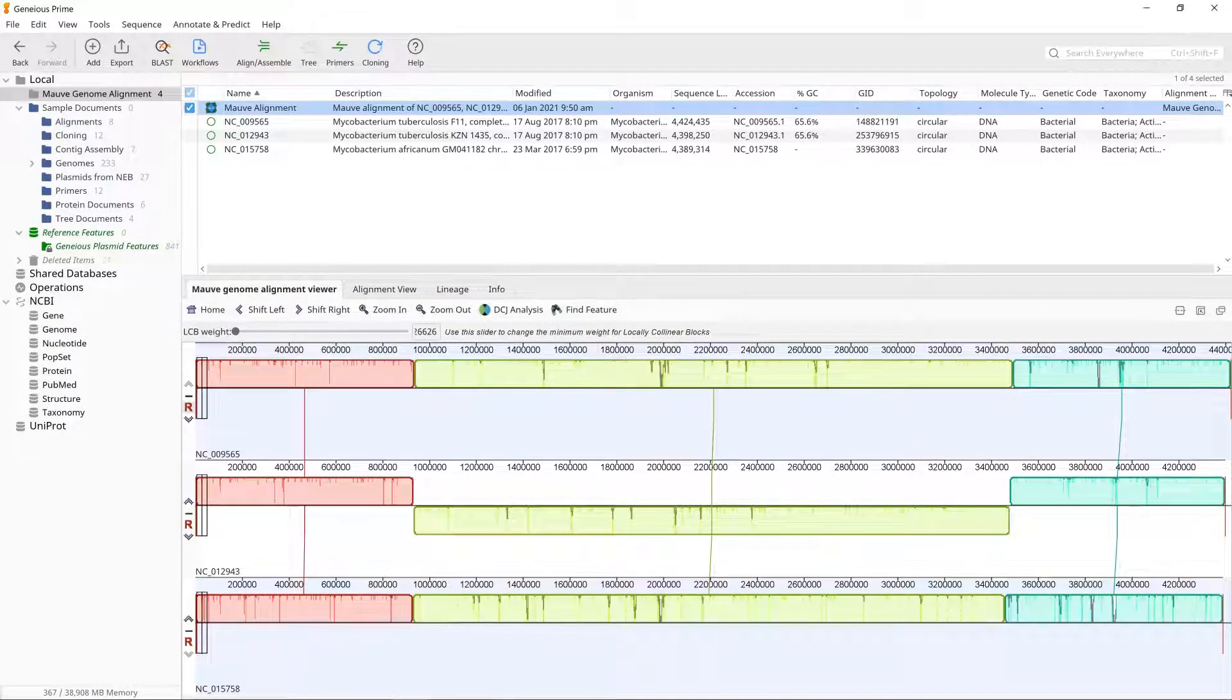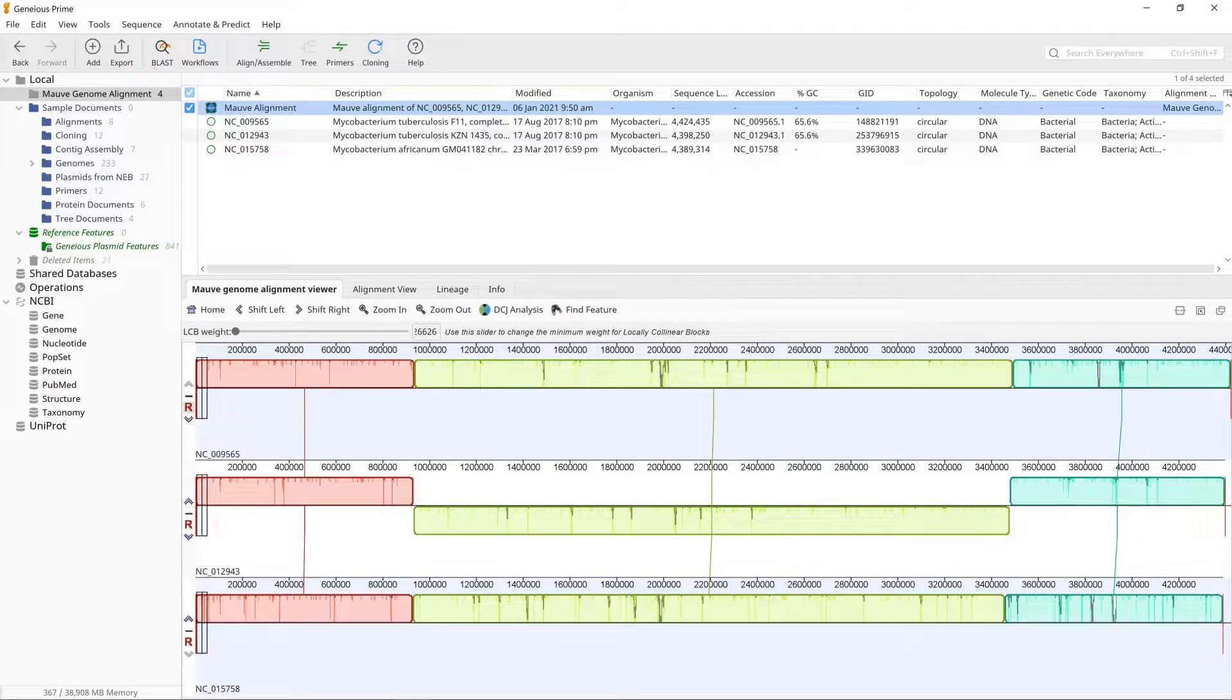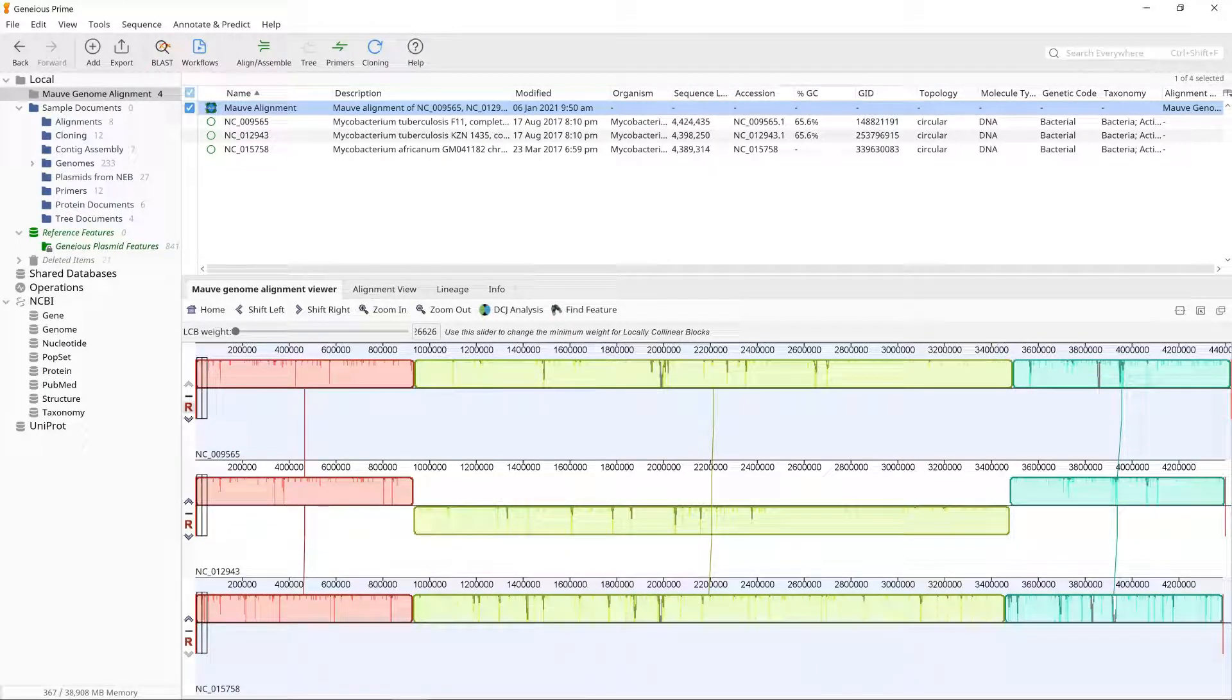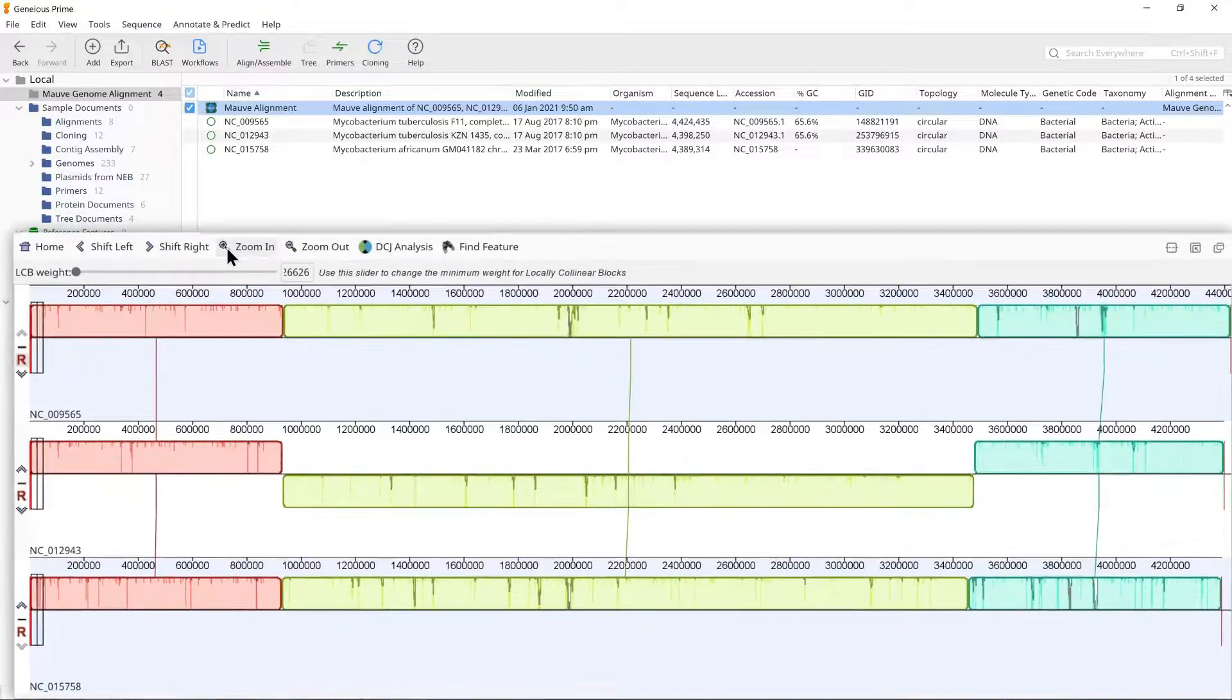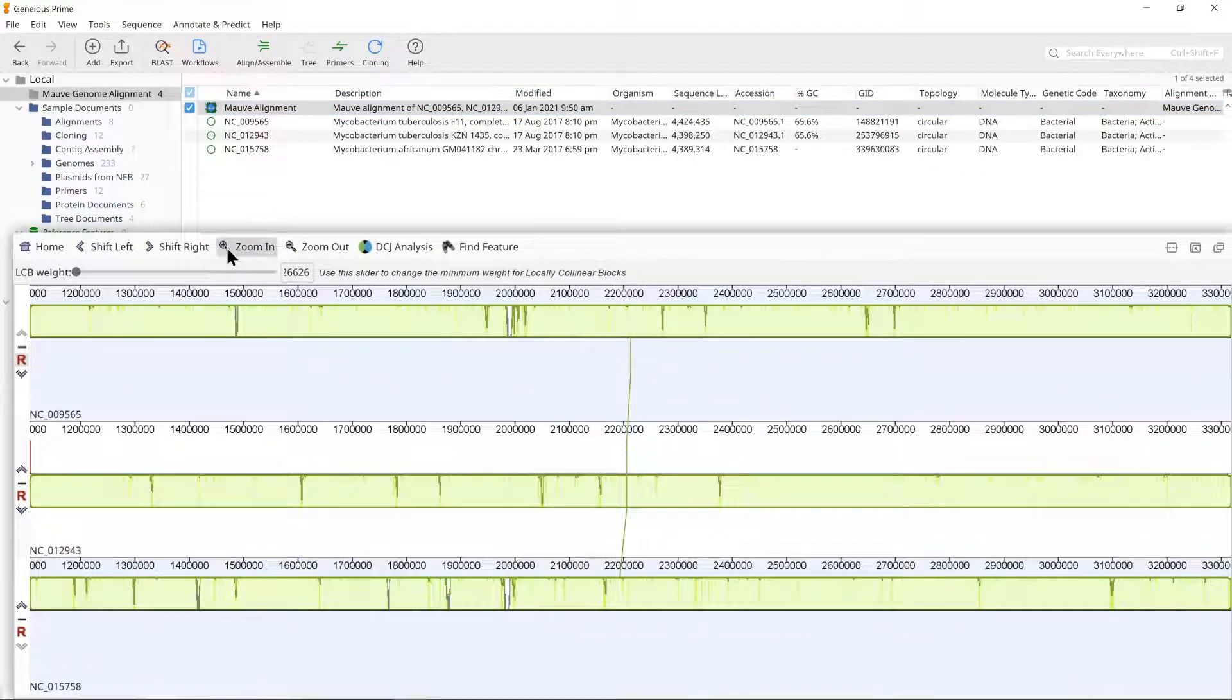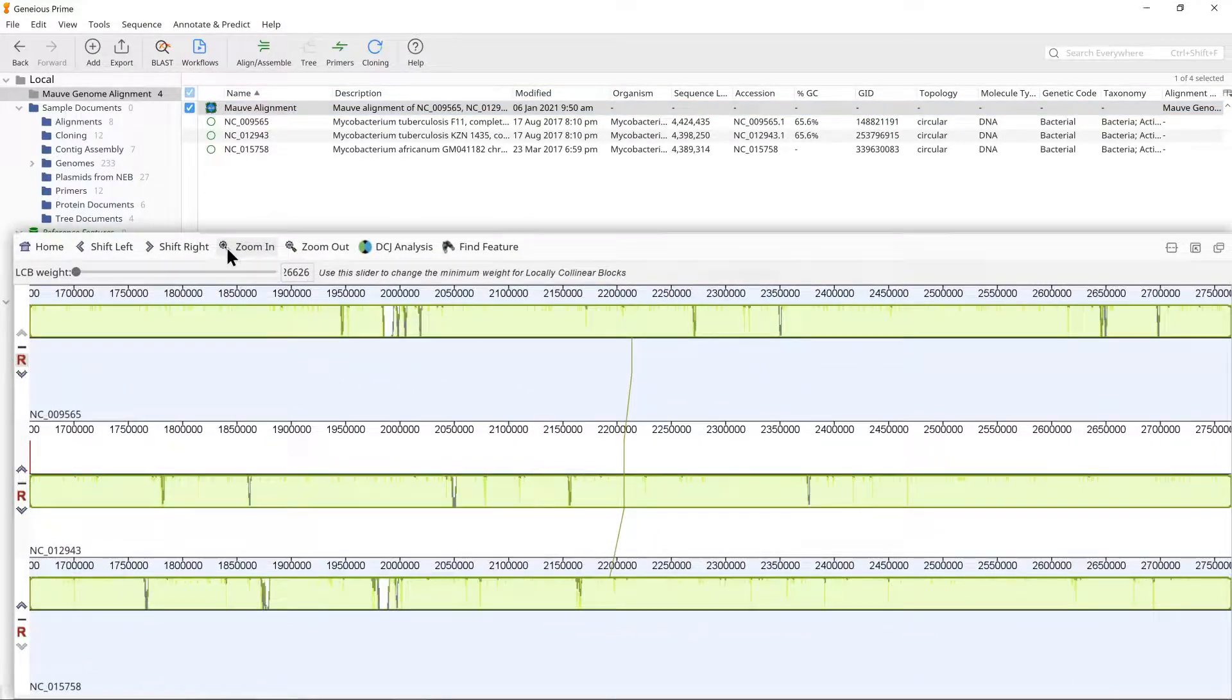The MOV viewer has its own controls for zooming in and out and scrolling to the left and right above the viewer. Try zooming in by clicking the Zoom In button three or four times.